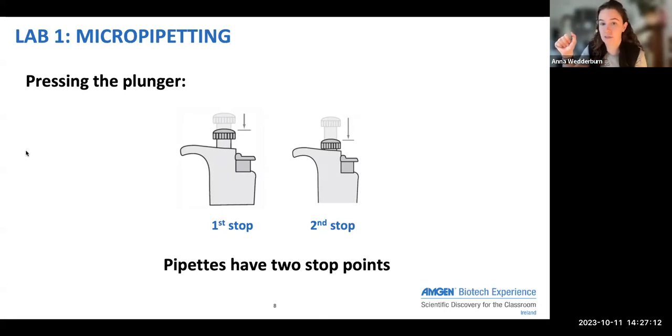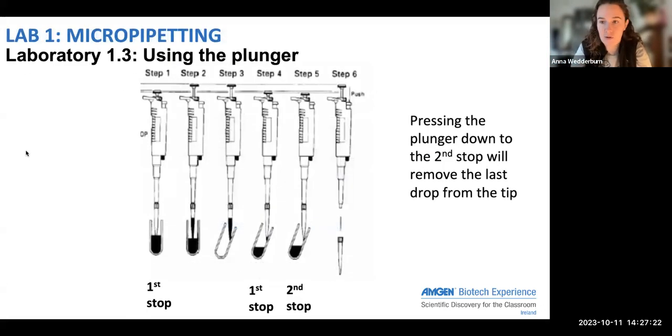And then for that, when you're expelling it, you go all the way to the second stop, and that just makes sure that all the liquid actually gets kind of kicked out of the pipette. So this is a diagram of the way to do it.